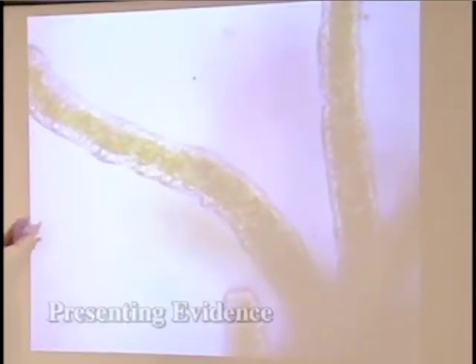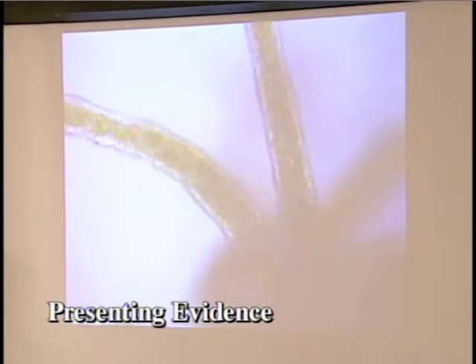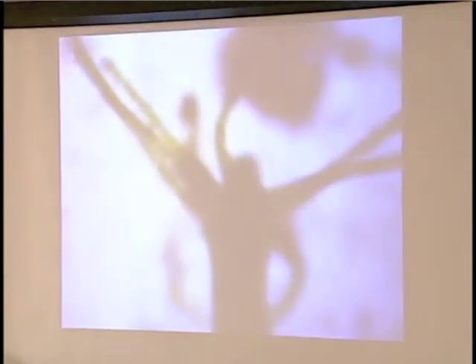What are we looking at here? Yeah, tell us, you guys that are experts on Hydra. What's that? The tentacles. It's a tentacle, right. Somebody called it the arms, but it's not really an arm. It looks kind of like that, though. Whoops. I know, it's hard to keep. Let me try going down in magnification. Maybe that would be a better view to see, except it's hard to see the yeast.